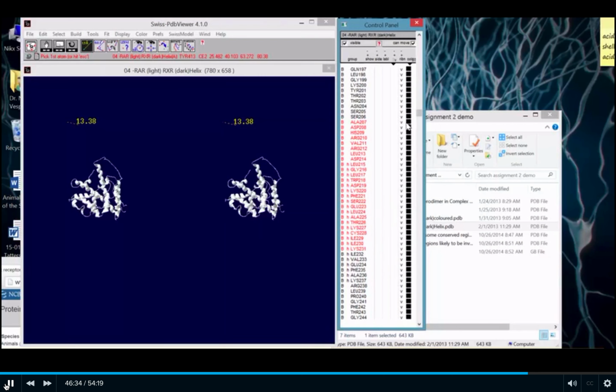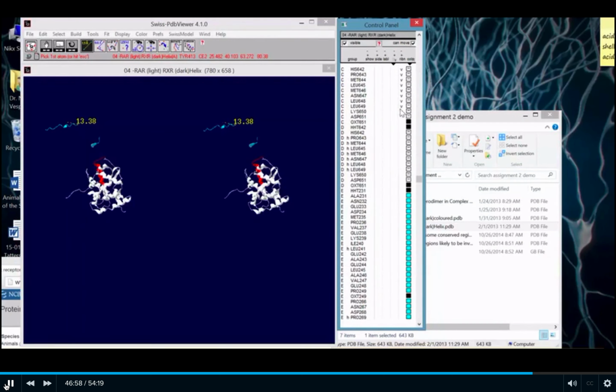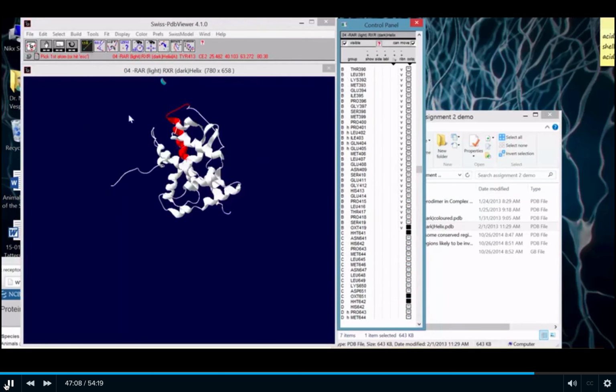If you take a look to see where it is, to make it easier, I'll color the ribbon. Let's say red. And let me show the entirety of this protein. So I just want to show B, because that's part of my protein here. B, go all the way down. So I'm just showing my protein B. There's a known splice variant in the literature, and I'm trying to ask, well, what does that splice variant do?